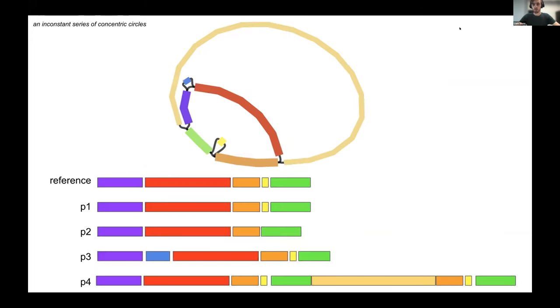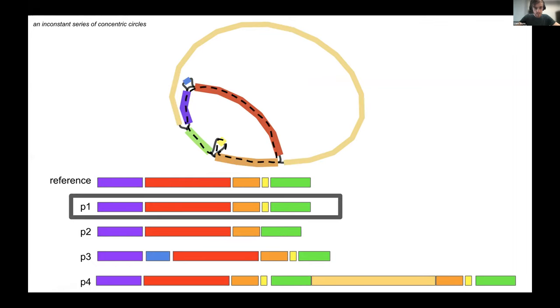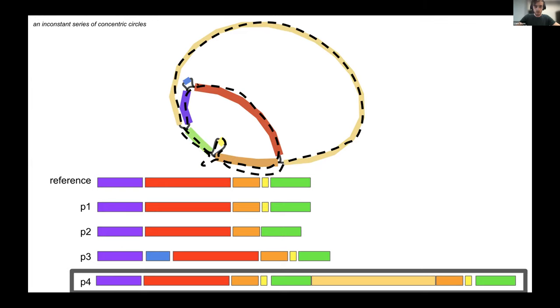Any particular plasmid genome will be a walk through this graph. So a closed loop that goes around the graph. For example, we have plasmid one, the reference, and here I'm showing the linear version of the alignment blocks that pan graph has discovered in these plasmids. If we take plasmid one, let's start at the purple. We're going to go purple, red, orange, yellow, green, and then we're back where we started. If we take plasmid four, we're going to go purple, red, orange, yellow, green. Then we've got this similar yellow color. We go all the way around that loop. Then we go orange, yellow, green again, and we're then back where we started.